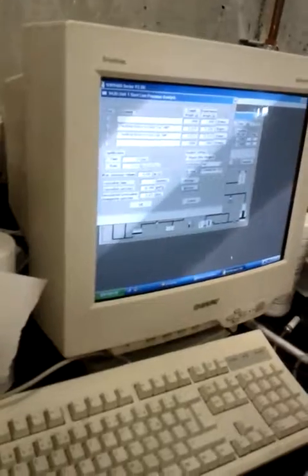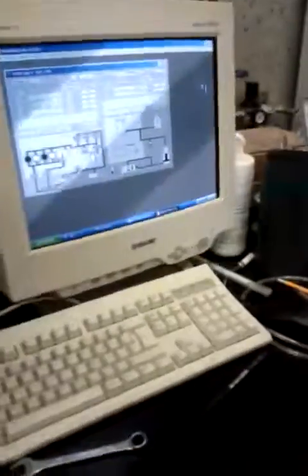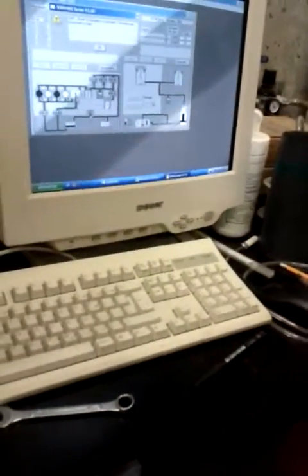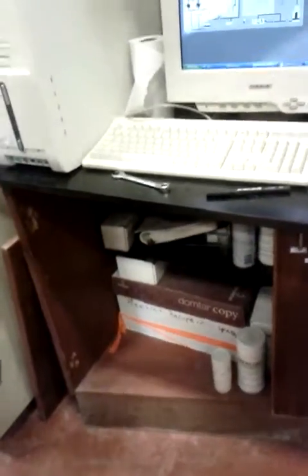So we only have to click OK, and now we have to wait. How long? The whole analysis is about a quarter to... Oh, the mercury is low. Okay, I have to refill it. I will go to my office, where my mercury is. Okay, you have to stay a little bit far from me, just because I will work with this liquid mercury. Okay.